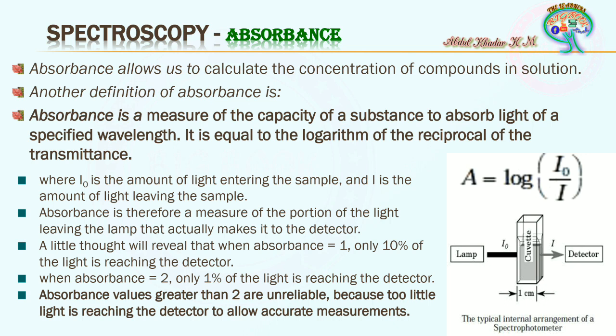Diluting means you have to dilute the whole set of samples from blank to sample. For example, in protein estimation by the Lowry method, there will be 4 to 5 standard concentrations and also the samples. All of them you have to dilute with a particular dilution. After that you have to measure the samples again.